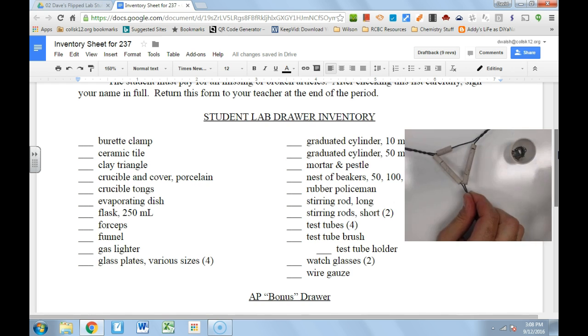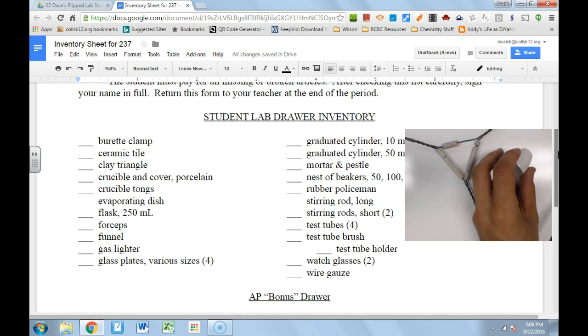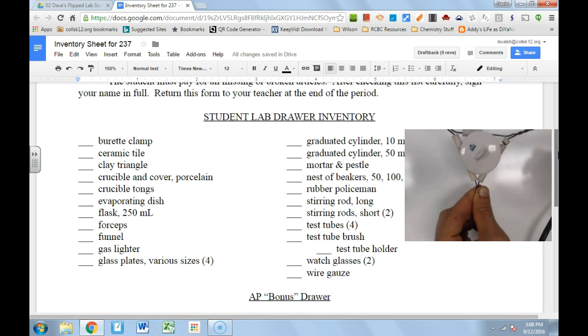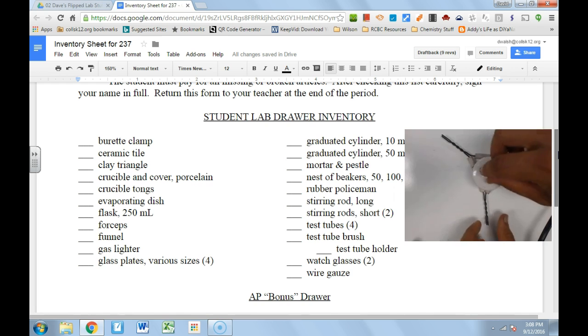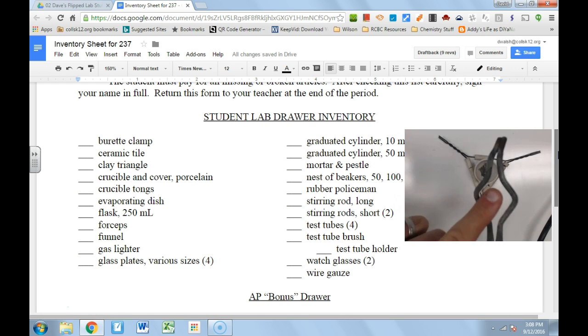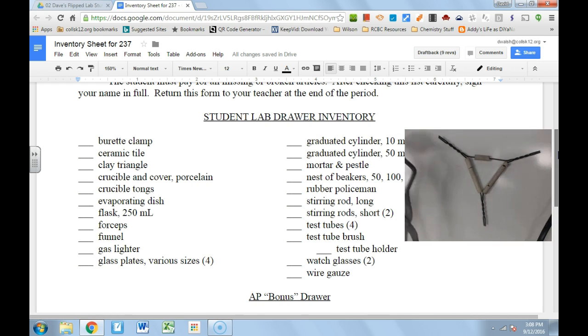The crucible comes with its cover. The crucible is used to heat different substances — put your substance in the crucible, put the crucible in the triangle, lid on, ready for science. We can then use crucible tongs to pick up crucibles. Don't be fooled by the little hole — pick it up correctly. This is the most expensive piece of glassware in your drawer, and you are financially responsible for glassware once you check it in.